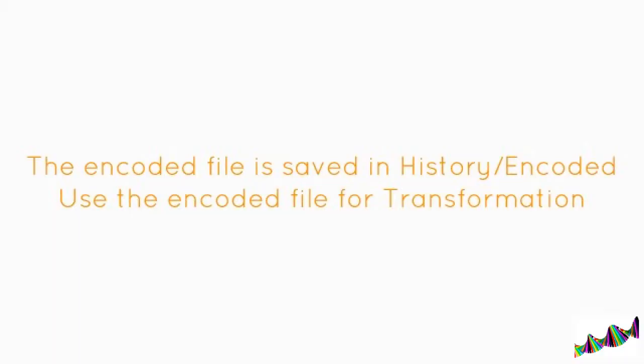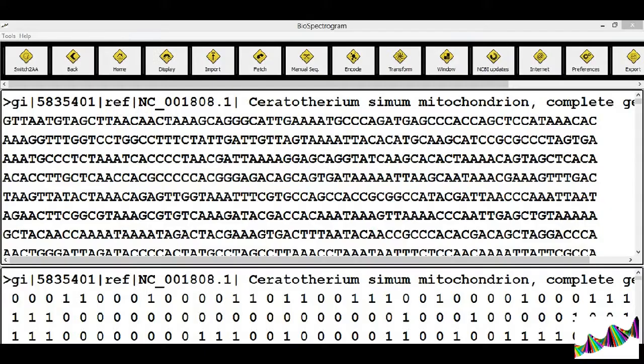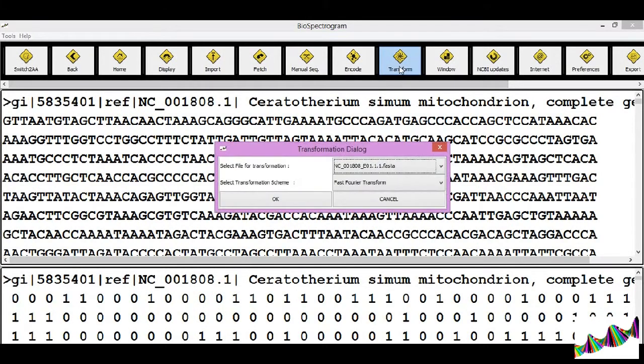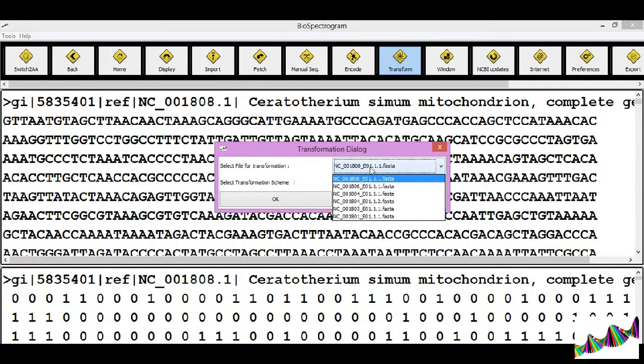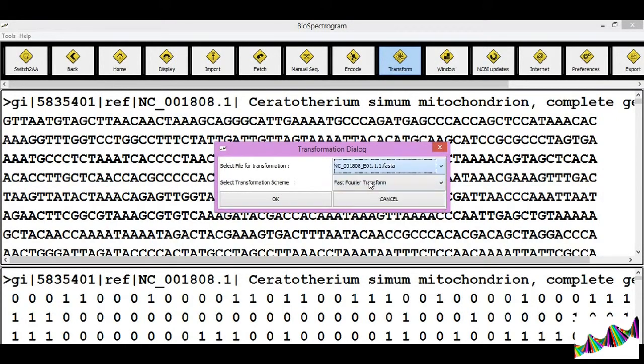The encoded file can then be used for transformation. Click on the transform button, then select the encoded file that you wish to transform.